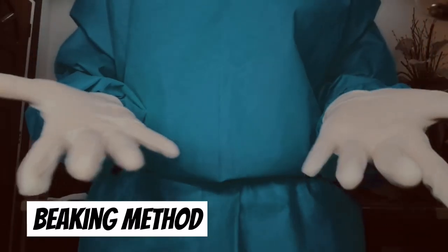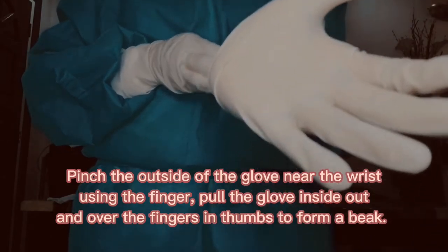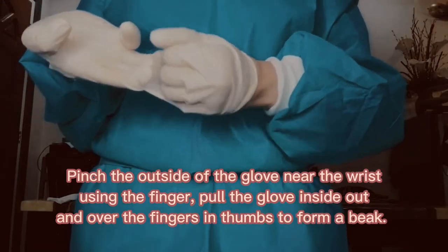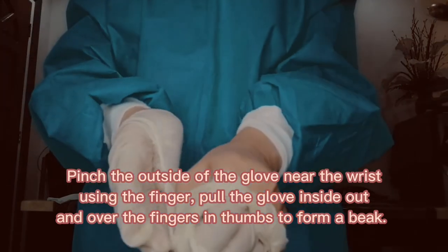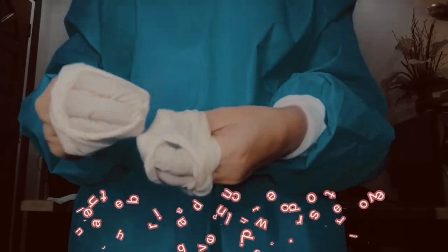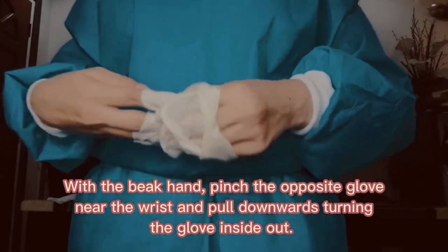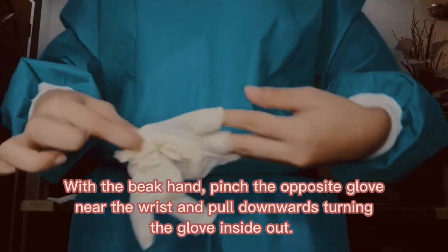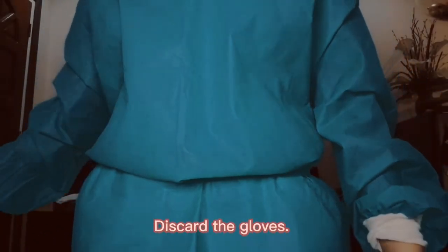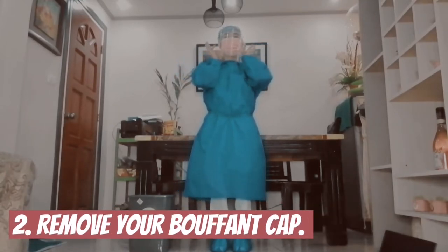For the beak method, pinch the outside of the glove near the wrist. Using the finger, pull the glove inside out and over the fingers and thumb to form a beak. With the beak hand, pinch the opposite glove near the wrist and pull downwards, turning the glove inside out. Discard the gloves. Remove your hair cap.